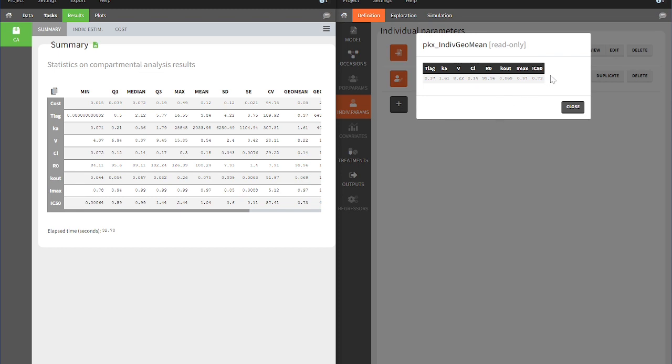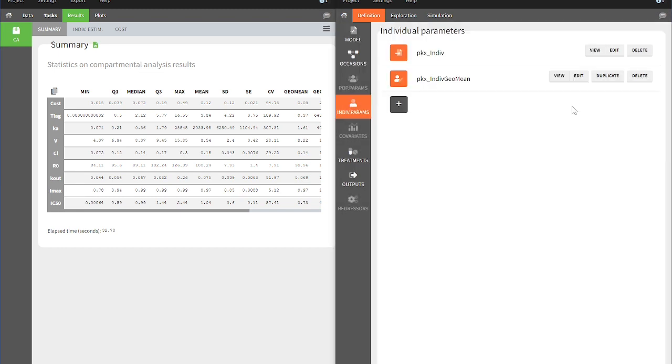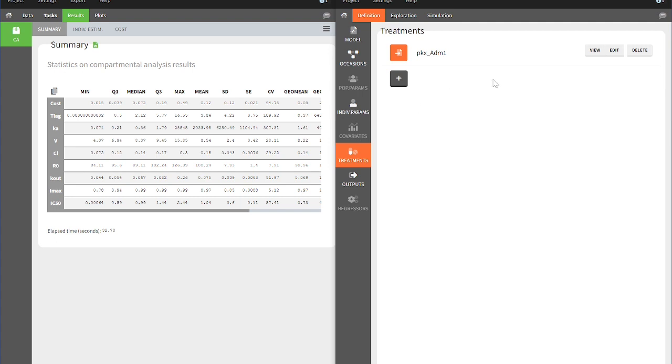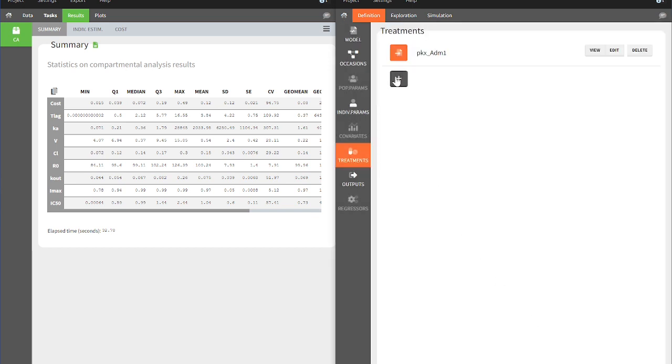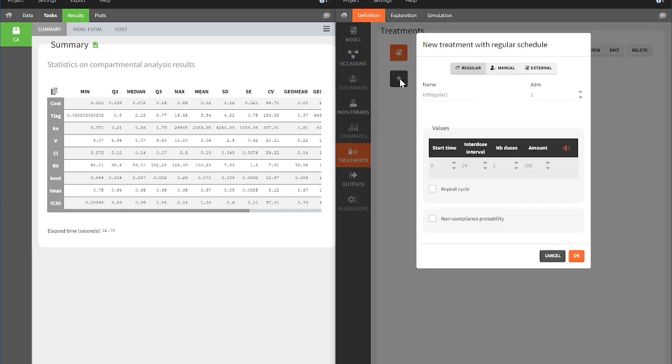The Treatment section consists of the treatment information that comes from the original dataset used in PK-Analyx. By clicking on the white plus in the gray box, we can create a new treatment strategy to simulate a steady-state scenario for the same individuals.